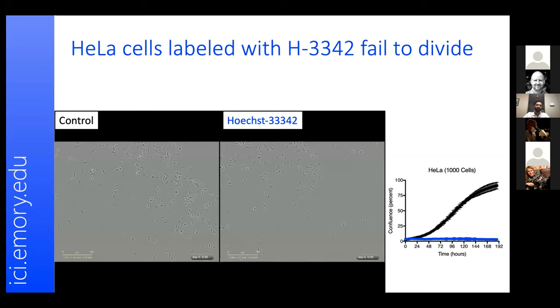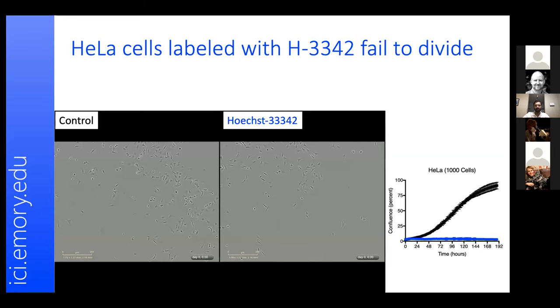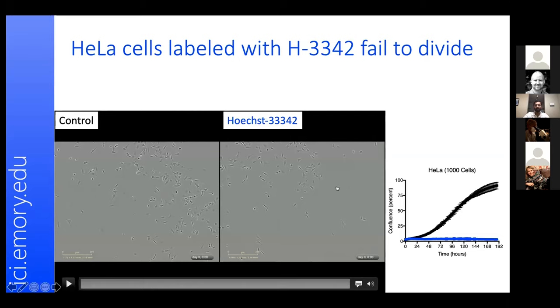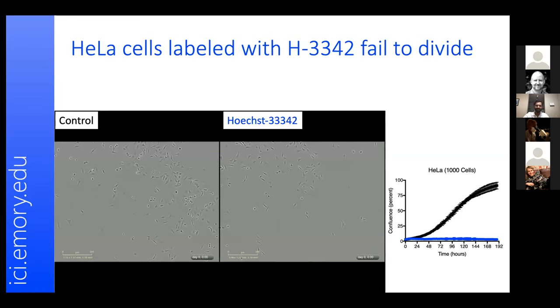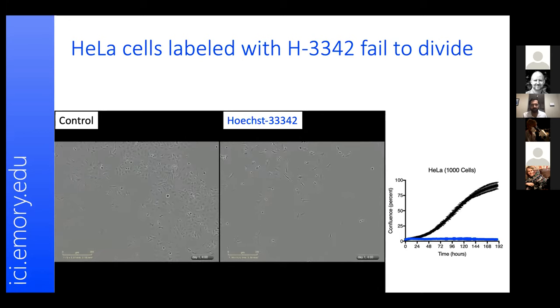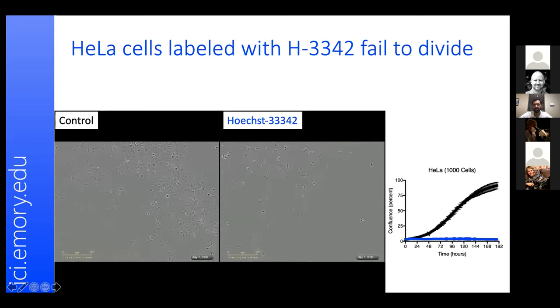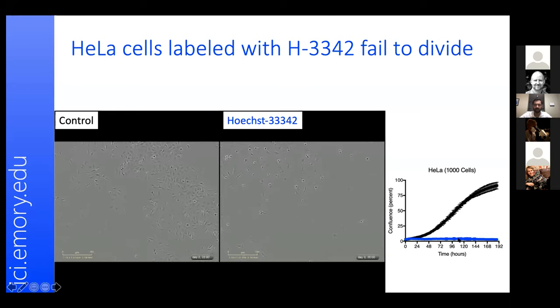Let's look at the use of Hoechst directly. HeLa cells were labeled with Hoechst 33342 on the right side, and controls with no dye on the left side, then allowed to grow for seven days. The title gives you the answer: on the right, HeLa cells fail to divide, whereas on the left they are dividing perfectly fine. When quantified, control cells continue to grow normally while Hoechst-treated cells fail to divide.